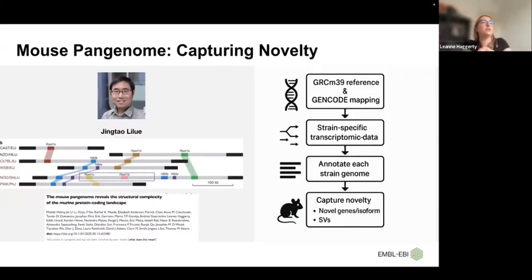And then I guess there's lots of tools out there for constructing these pangenome graphs, which is maybe what people want to look at. So PGGB, oh, my friends in the comparative team would kill me for not knowing the names of all of them. But again, this is something I can provide in resources after. It's like, here are all these links to things that you can start to build your own pangenome graphs from.